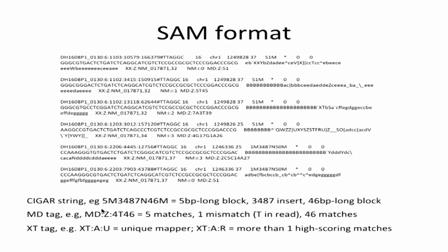This is the SAM format again. This is typically what you get out of the aligners. We'll discuss this, so no point in discussing this further. Again, you don't really care about variants. You don't care about sequence differences between the reads and the reference genome.